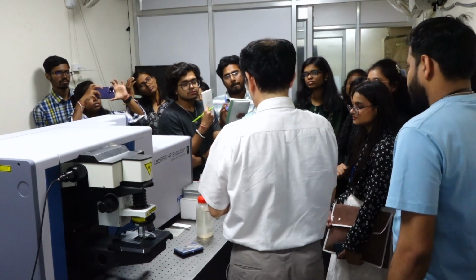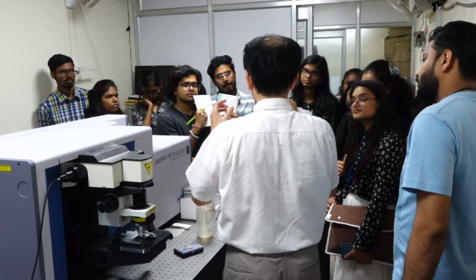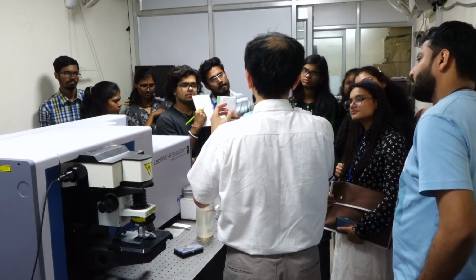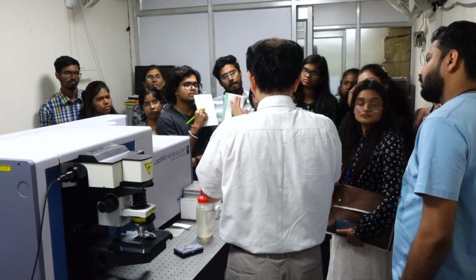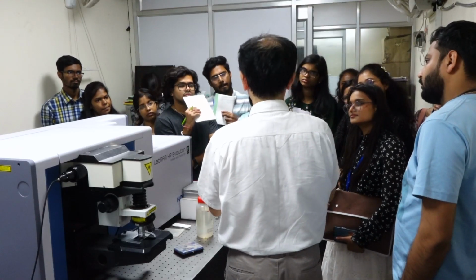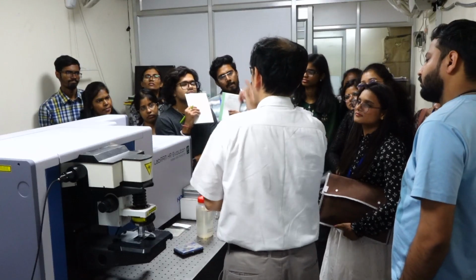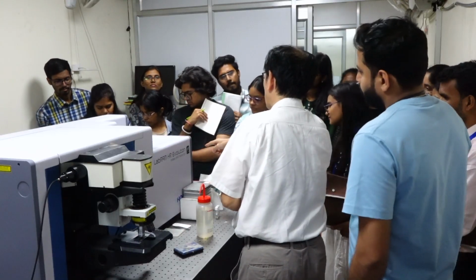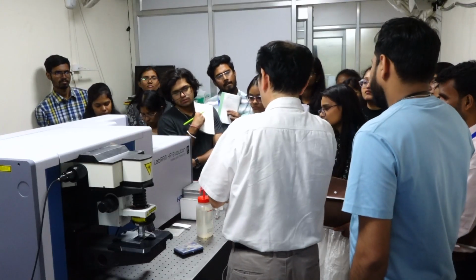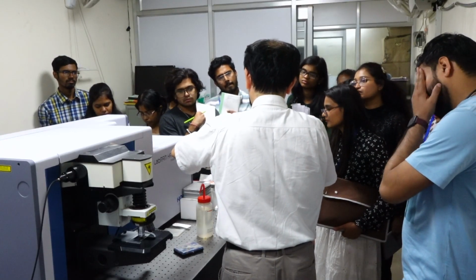I derived some formulation about Raman intensity. Raman intensity, I Raman, is in proportion to I0. If we introduce a stronger excitation beam, then the Raman scattering should be stronger. Laser output power is constant. If we focus the laser power in this size, density is a certain value.